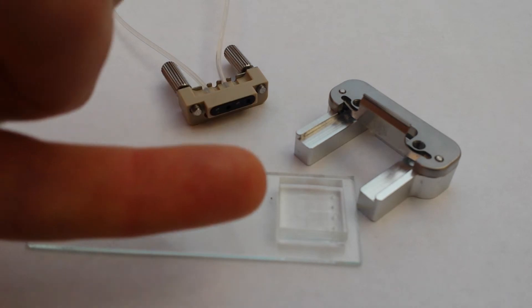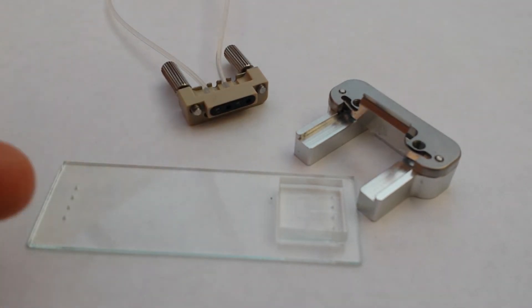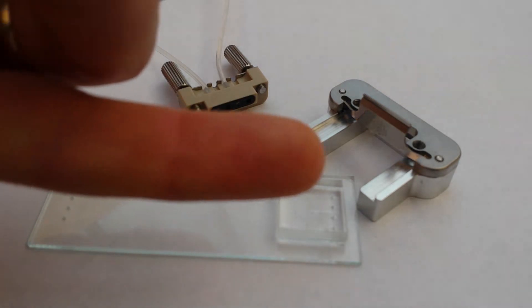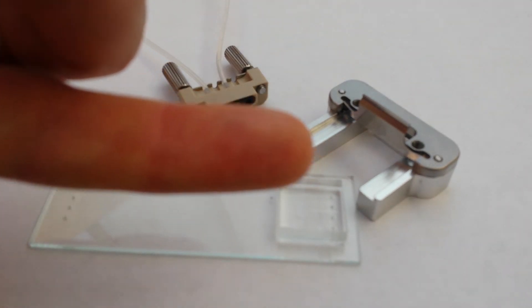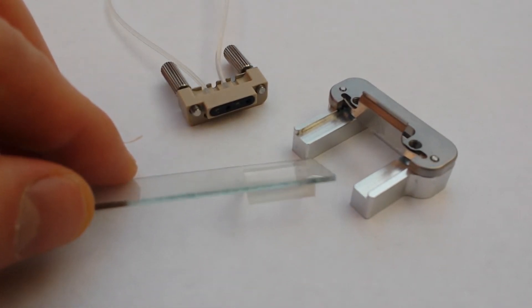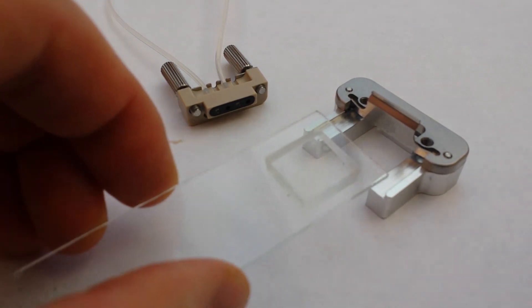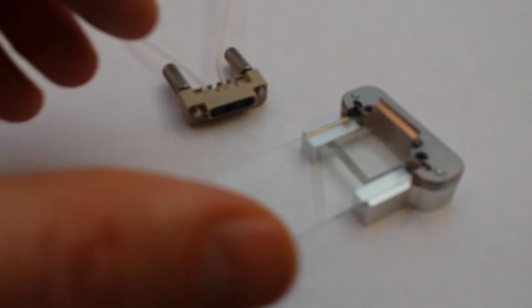So I'll show you how this actually works. The PDMS has been bonded to the glass slide following the design rules — the holes on the PDMS are lined up with the holes on the glass slide. When you turn it around, you have a hard surface against which you can bond. I'm going to slide this into the mounting block. You can imagine the amount of engineering that has gone into a part like this — this is not trivial engineering.